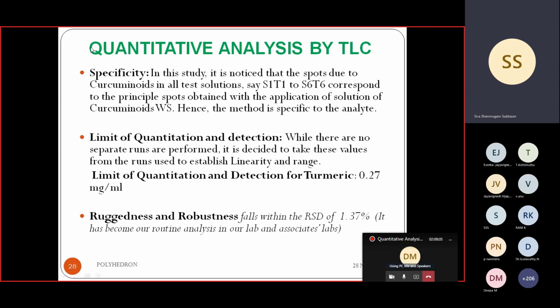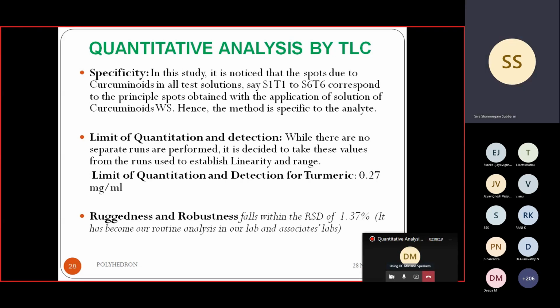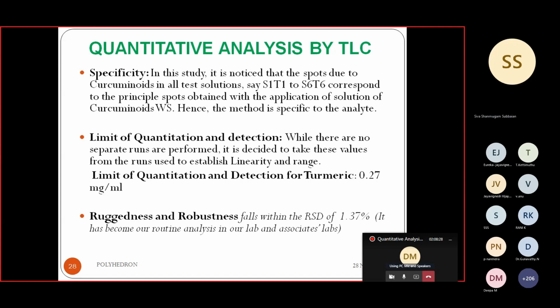With these things, I am confident, and I'm very sure the quantitative analysis by TLC is no way inferior to HPLC. Let us really see, we'll compare in the table on the next slides, then we'll try to understand still more in a better way.